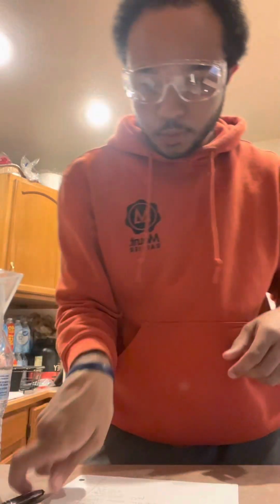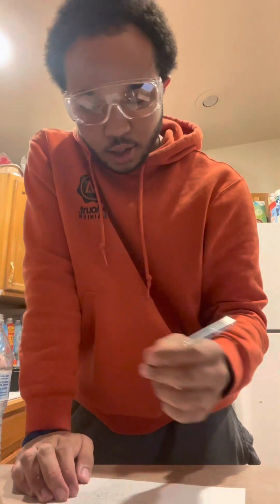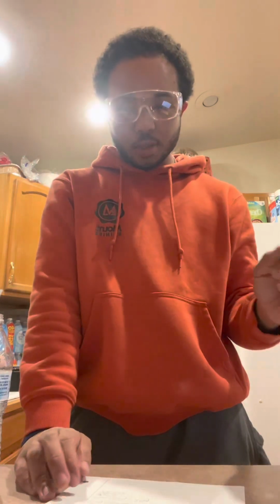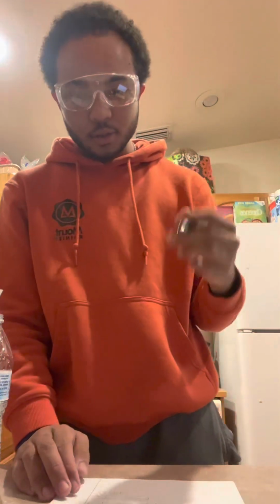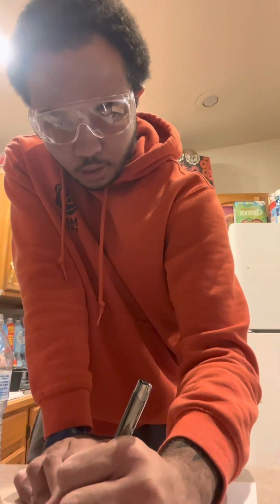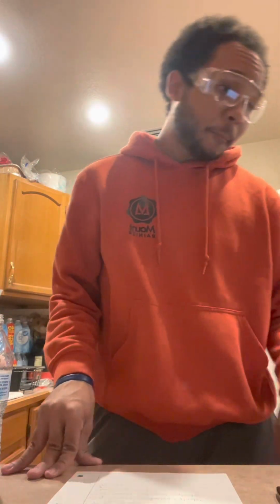So since I got it pretty much exact on the 25 milliliters, it would be 25.0 because 25 is our certain and 0 would be the uncertain, so 25.0 milliliters. So yeah, 25.0 milliliters.